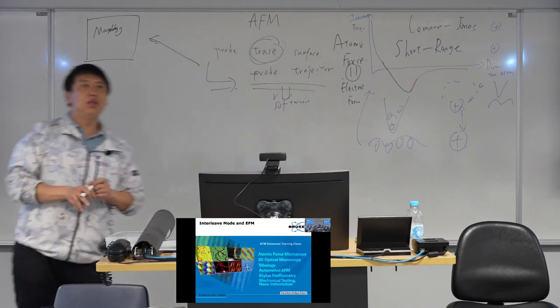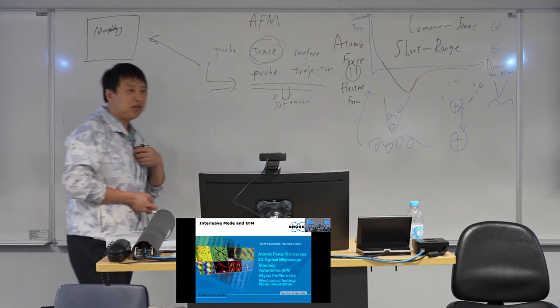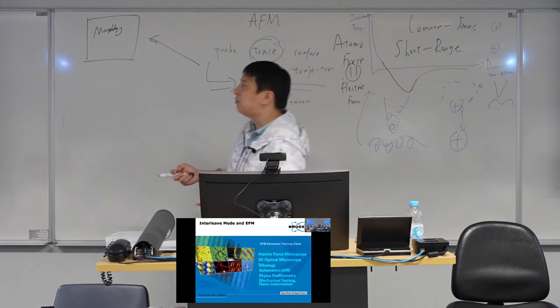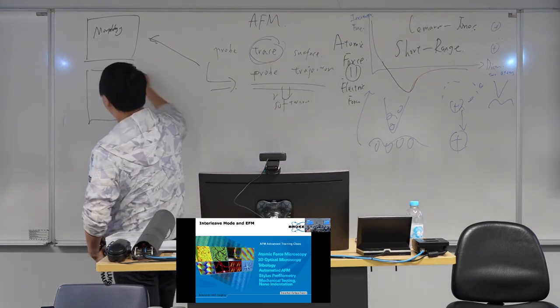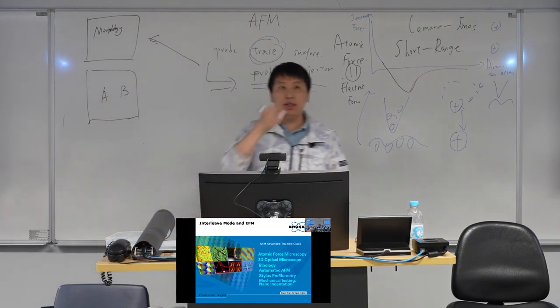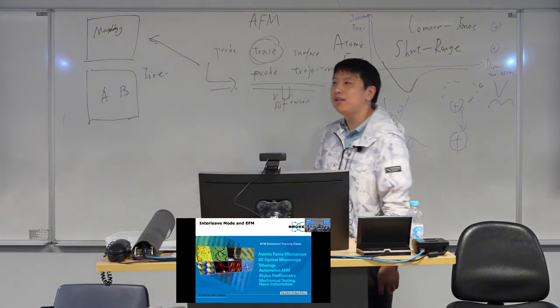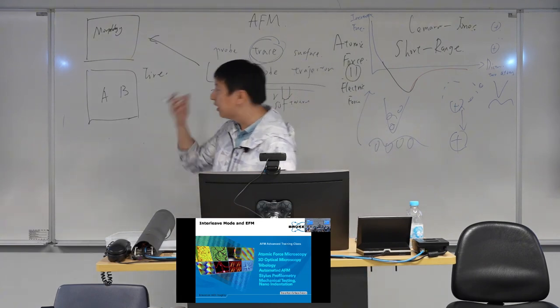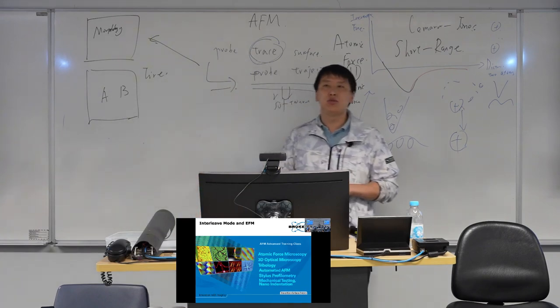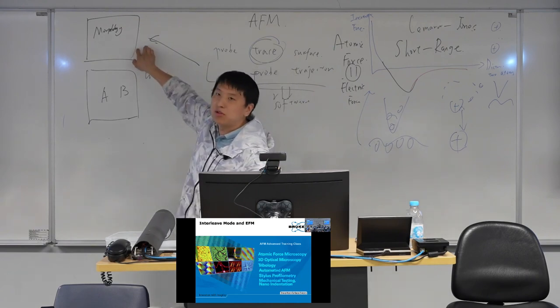But in today's material study, that's not the whole story, because we would like to know what the materials are on our sample. If, for example, we have a binary surface, we have a material A and we have material B. For example, the tire. We have a tire, right? In a tire, there is rubber and carbon. If we are studying binary samples, we always want to know more details about this material rather than its morphology.